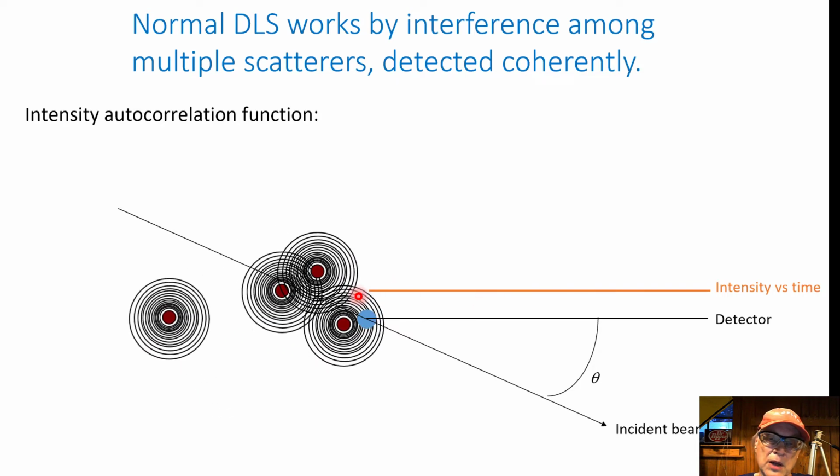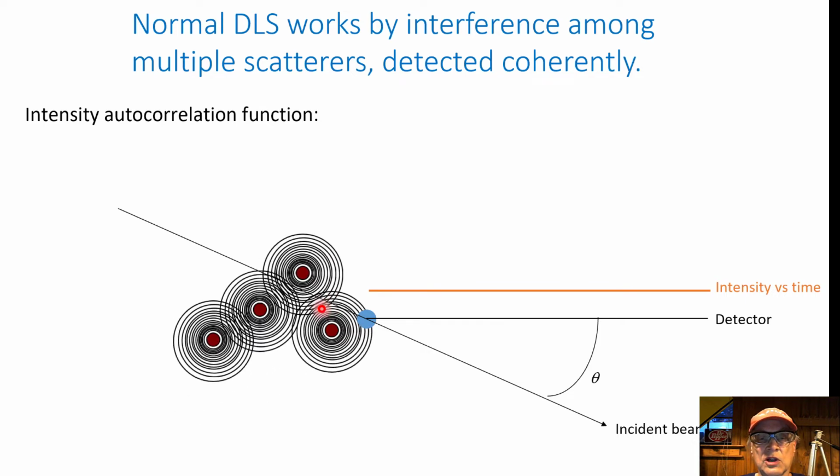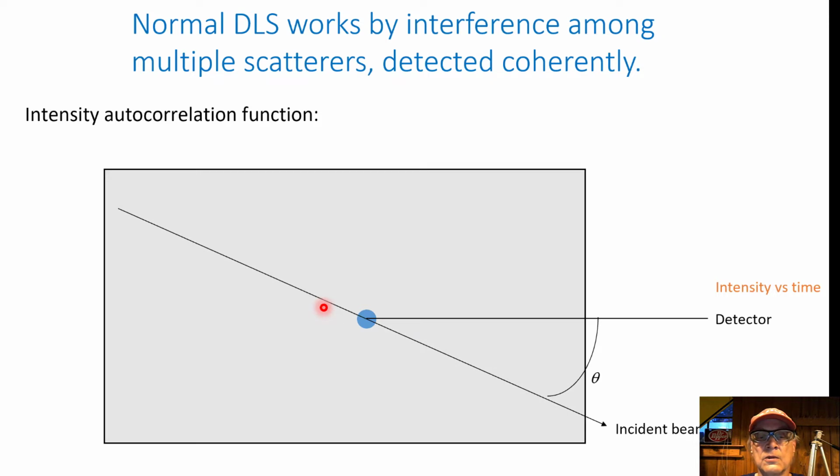So if we want to see the fluctuations, we have to look at a smaller area. So let's put in a pinhole. Let's just look at one little area. This should do it here. Here it comes. There's a pinhole. And you can see behind, now and again, you'll see a particle go looping. There it goes. Okay, so they're still diffusing back there, but we're only looking at the light through this little hole now.